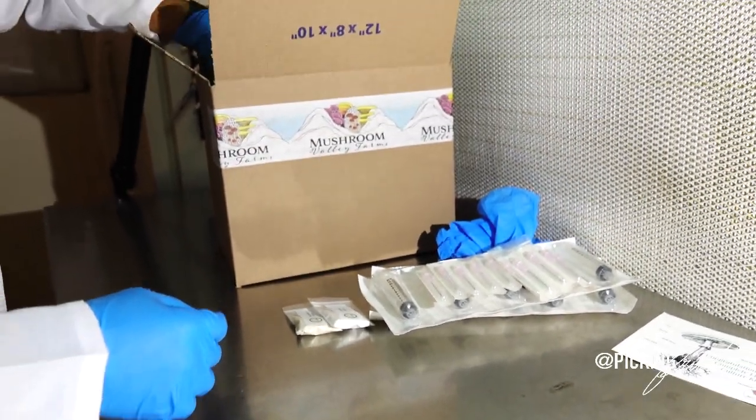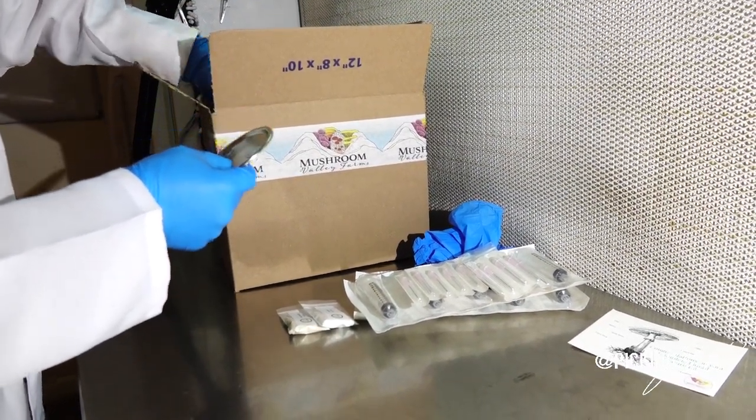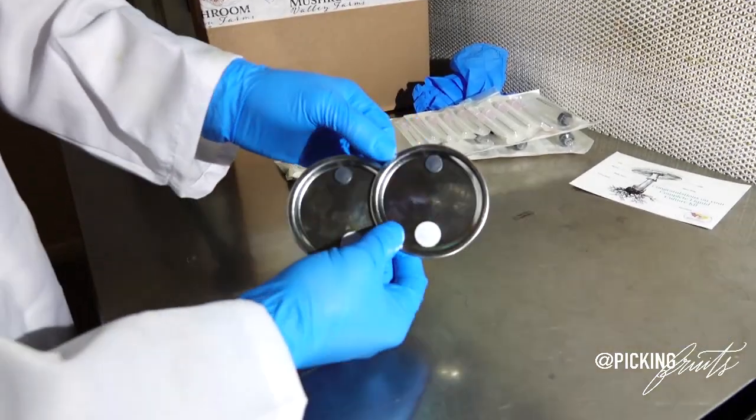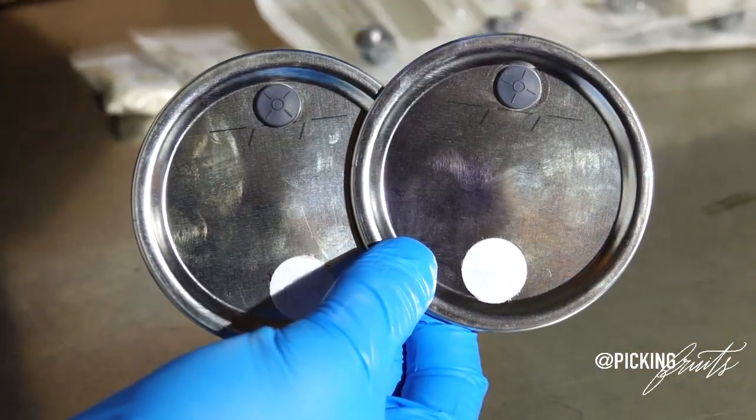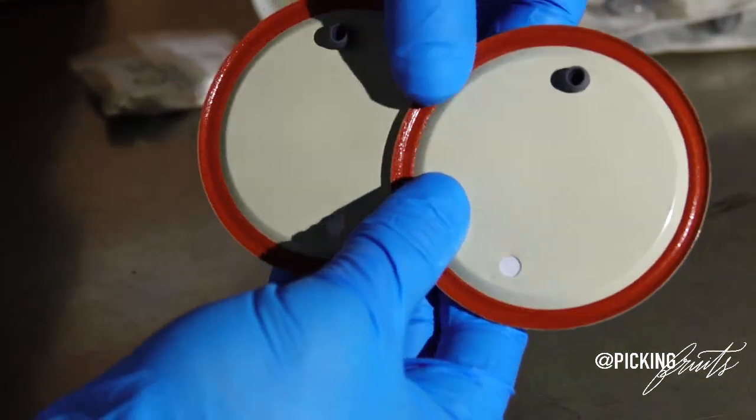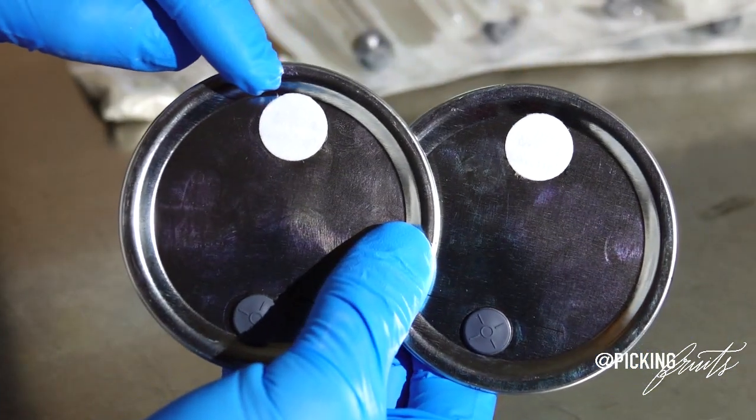The next thing you will find in your kit will be two modified 1 quart wide mouth lids. They've been modified with silicone injection ports and they've also been modified with gas exchange filters.